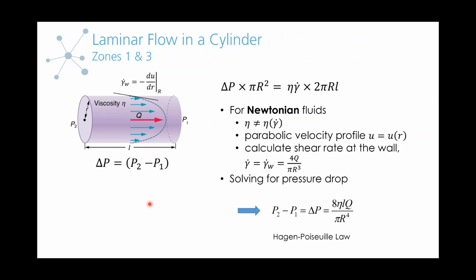Okay, so as we discussed, we're looking at flow in a cylinder. So there's different zones in the syringe, but they're all flow inside of a circular conduit. So let's focus first on zones 1 and 3 because these are the simple uniform diameter cases. And as we go through this and we do basically a ratio of pressure drops across the different zones, in the end we don't even really address zone 2 because it's clear that the needle portion is really going to dominate. But I'm giving away my talk, so let me go ahead then.